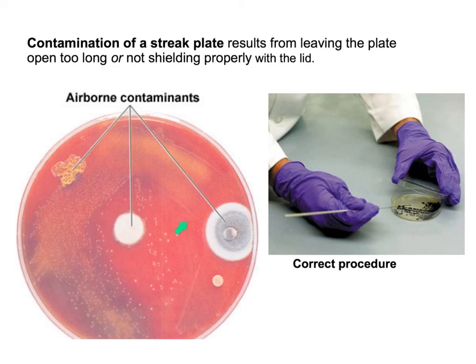To minimize this, we want to keep the lid on our petri dish as much as possible. We only want to raise it a small amount when we're working with the dish, and then immediately place the lid back on. We want to do everything we can to minimize these airborne contaminants.